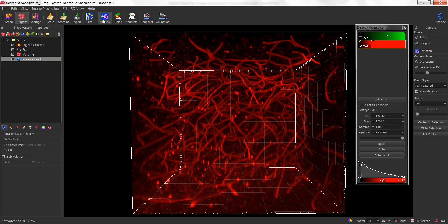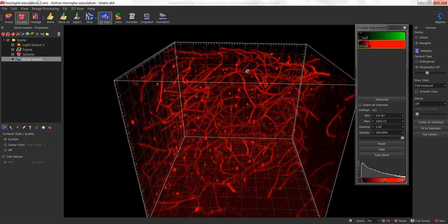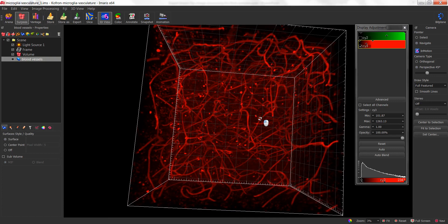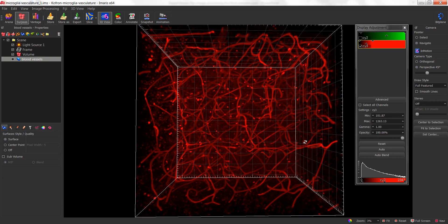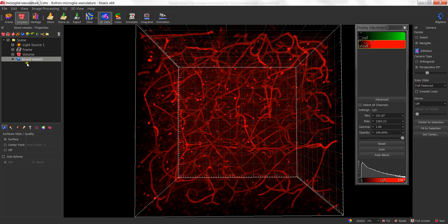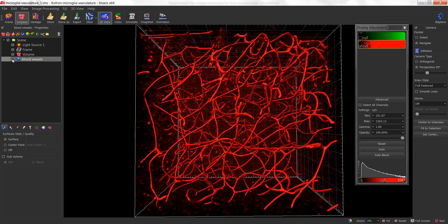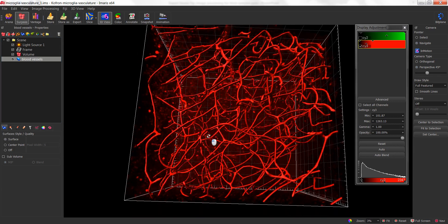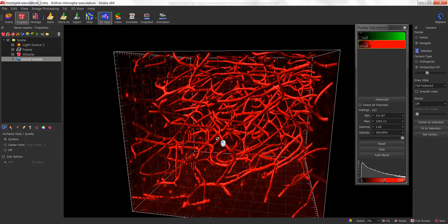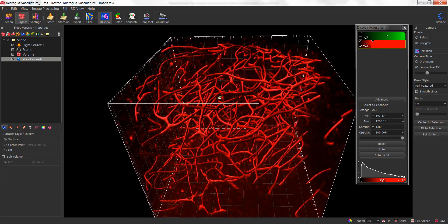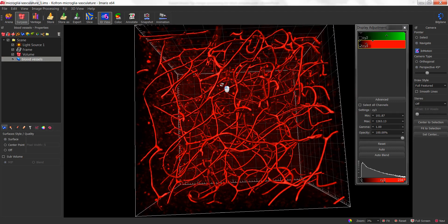The next image processing function I'm going to show you is a masking function, and this can help us to get rid of the background information and make it easier to visualize and analyze the blood vessels. The first thing we need to do is create a surface that represents the objects of interest — in our case, the blood vessels. Here is a surface I've created for the blood vessels. Remember, attenuation correction will make it easier to threshold a surface throughout the z-axis, and it's very important to implement a filter within your surface creation to get rid of the background debris or signal you're not interested in.